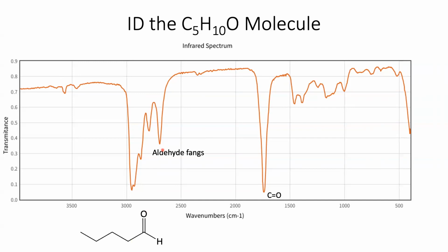It's pentaldehyde, because the aldehyde has to be on the end. And again, note, nothing really going on in the double bonded region. No corresponding hydrogen peaks for a double bond. This is a fairly nice, clean spectra, nothing unexpected. So these are classic ways where you can look at a molecule and get a good idea of what it is just based on the functional groups.